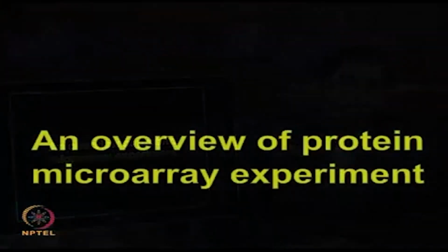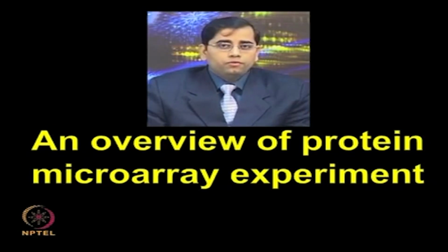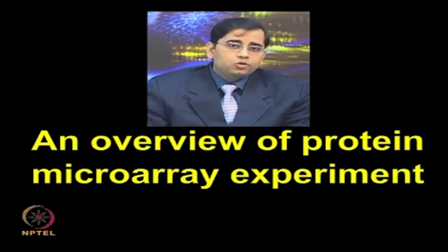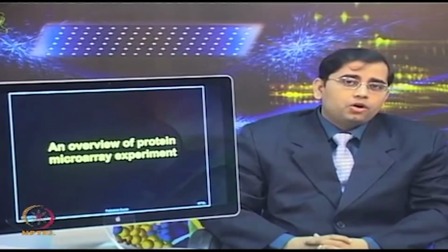So, let us first start with an overview of protein microarray experiment. Regardless of what application one wants to probe on the protein microarrays, there is a certain workflow which needs to be followed to perform such experiments. Whether you have a cell based or a cell free platform, you need to perform certain steps.